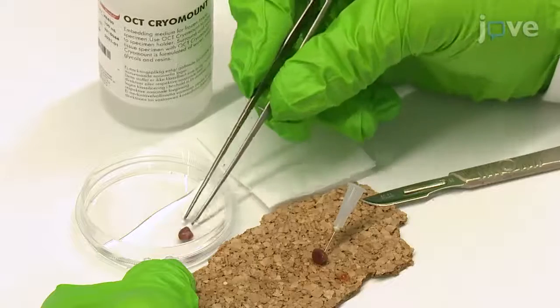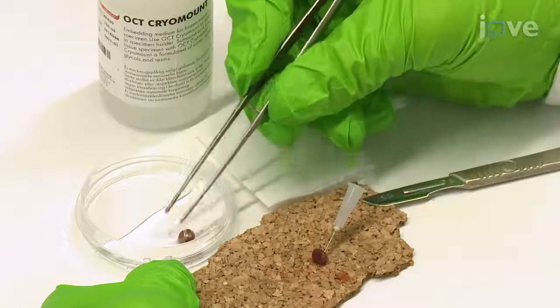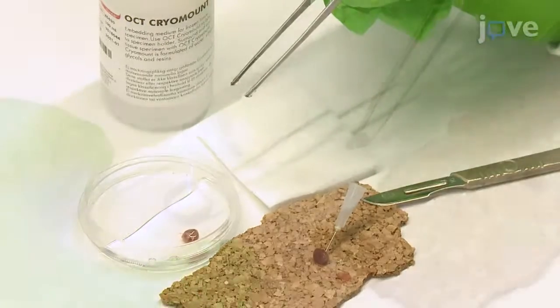Embed the aortic root and the base of the heart in optimum cutting temperature compound, or OCT, and gently squeeze the heart with the forceps to fill the aortic root with compound and to remove any air bubbles.